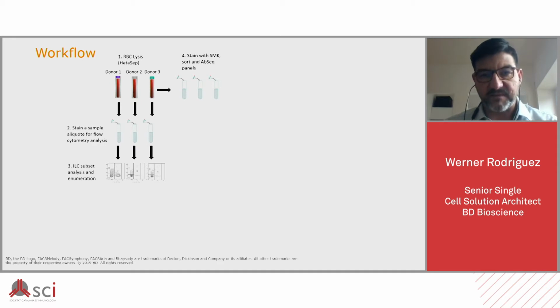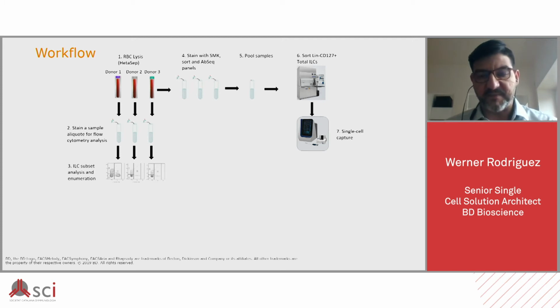One is fluorochrome-conjugated, to be able to use it in the sorting procedure, and another one is antibodies conjugated with oligonucleotides, and we will see later how we can use them through molecular biology applications to better characterize our samples. Then all the samples have been pooled together and sent through one unique sorting session in order to reduce the stress that could have been exposed to those samples.